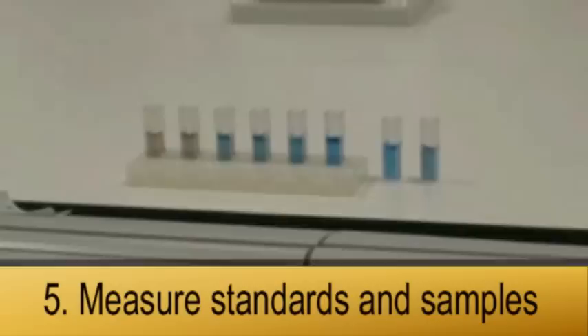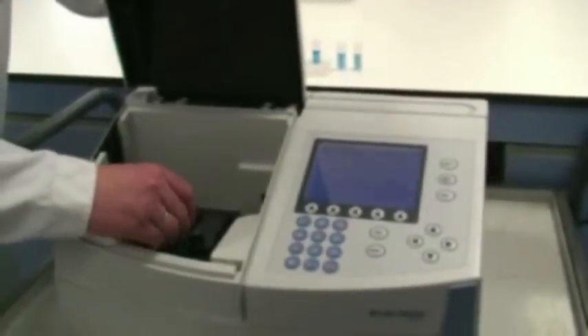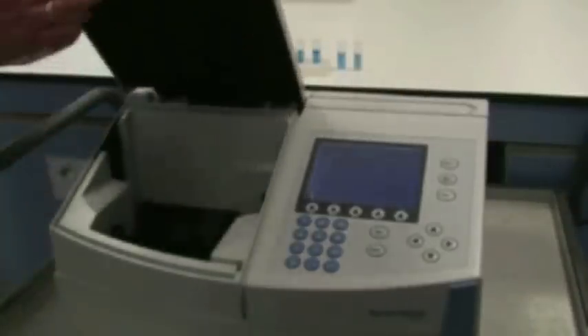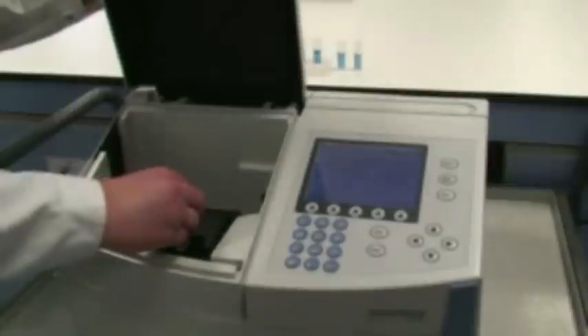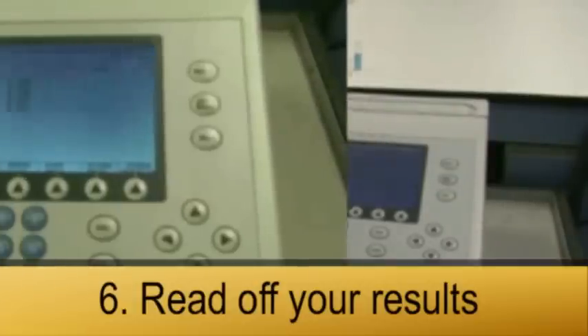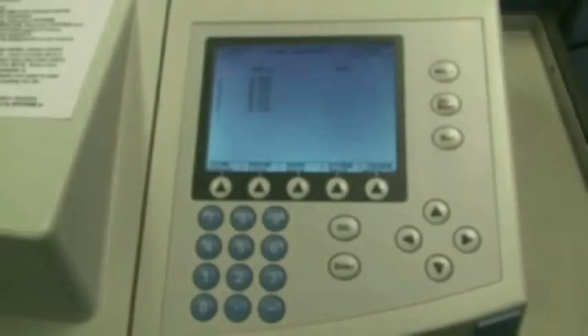Now you are ready to record your standards and your unknown samples. You will be putting your standards the same way that you put the blank into the spectrophotometer, doing all your standards one by one, pressing the button run and waiting for the results on the screen. Now you have got all your results from your standards and you can use them to draw your standard curve. You will measure your unknown samples the same way and extrapolate the concentrations of the unknowns from the standard curve.